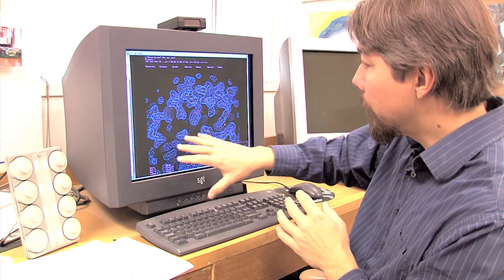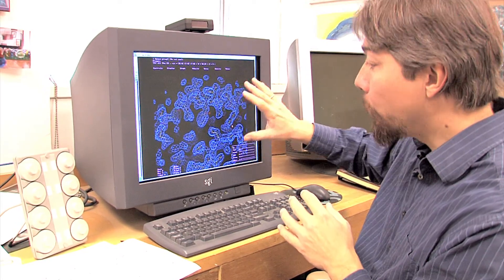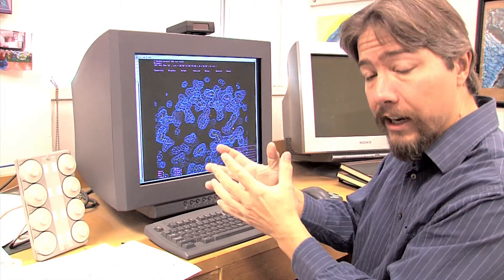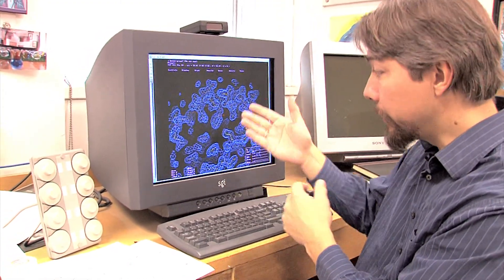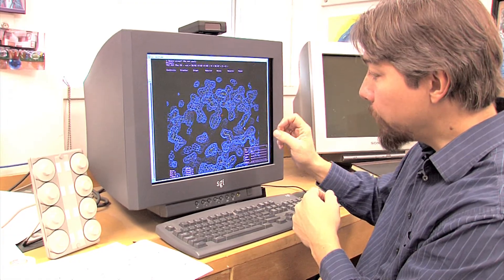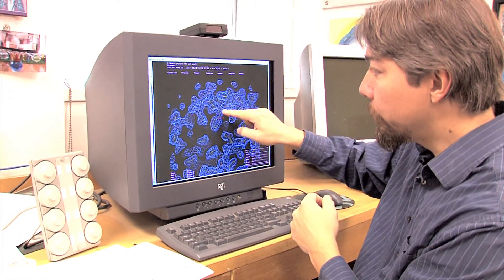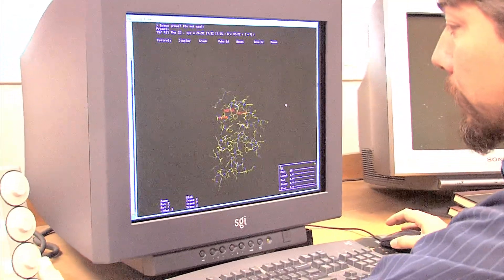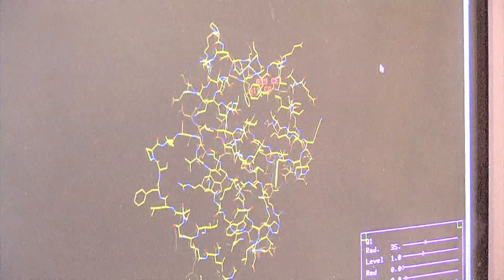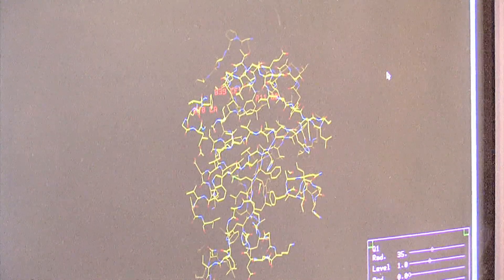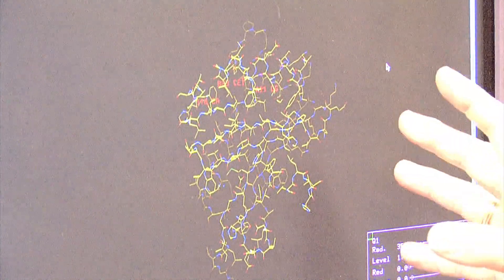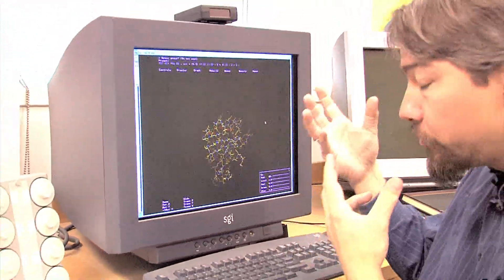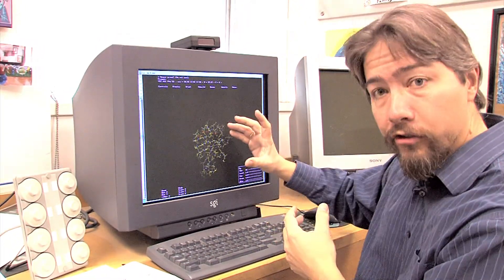In the end, what we get is a chemical model of the protein. So in blue here, you can see on this screen, this is actually the density of electrons that comes from our data. And then what we do is we build in the atoms that would fit these blobs, essentially. This is what the protein looks like in reality. So if we had good enough eyes, we could see this instead. We use X-rays. What this tells us about the protein is where all the important chemical groups are. And we can figure out how this machine functions based on how it's structured.